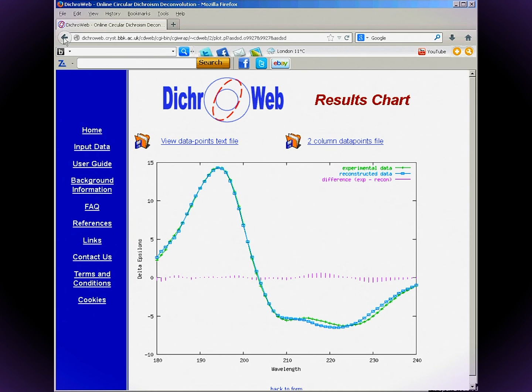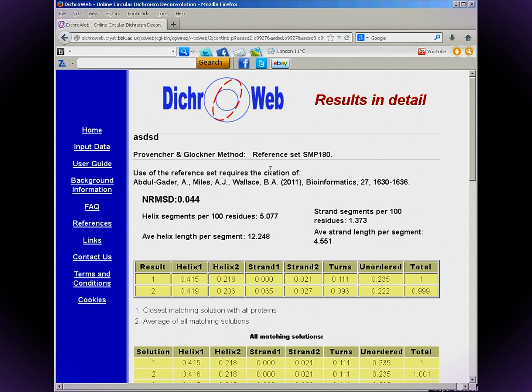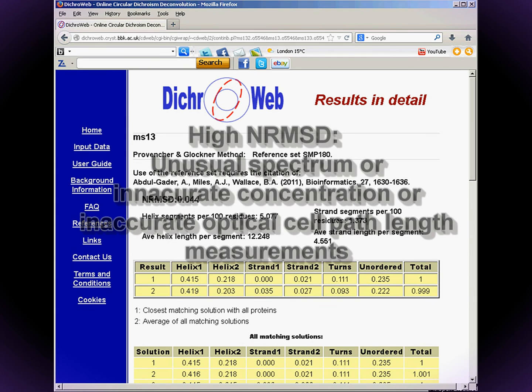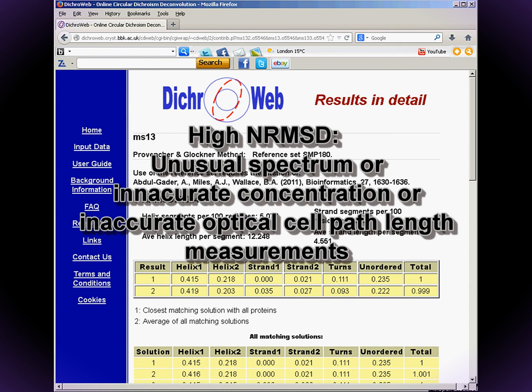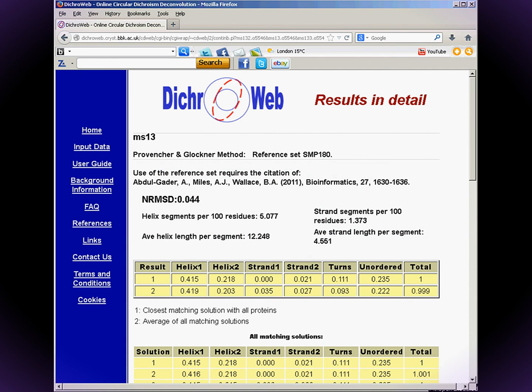For CONTIN, the NRMSD is usually below 0.05, but it may be higher for spectra that don't closely resemble any in the database, or if you've got inaccurate concentration or optical cell path length measurements. CONTIN shows two results; I usually use the closest matching solution for all proteins.